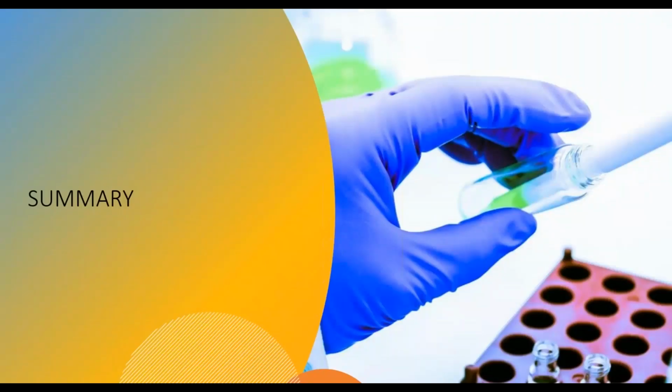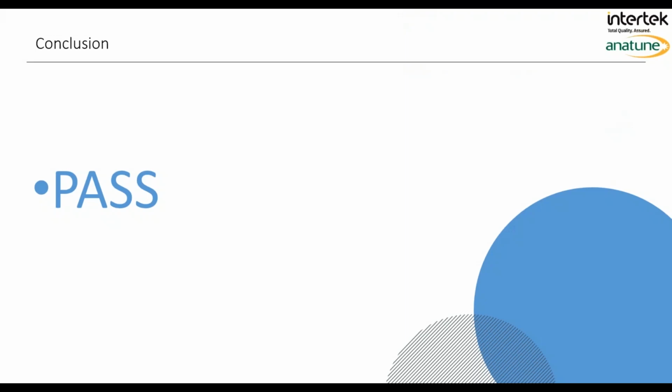So at that point, we'd covered all of the necessary parts of the ICH Q2 guidelines for method validation. And so to summarize everything we did and to give a result on that method validation, what do we get? Well, we got a pass. And so by modifying the ICH guidelines somewhat, we're able to come up with a methodology to validate this SIFT-MS method using ICH as the guidelines, and generate data that could be submitted for a regulatory submission for a pharmaceutical analysis.